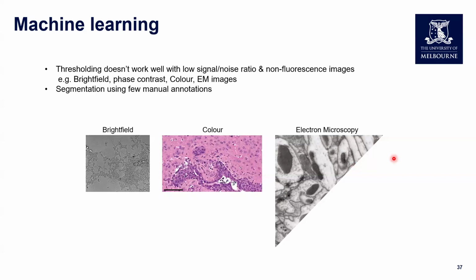In this approach, the pixel segmentation is done by the user annotating different pixel groups. What that means is that in most programs, you will need to label something like this, saying this pink is one group of pixels and this purple is another type of pixels. It's usually done with line drawing tools, like brushing tools.